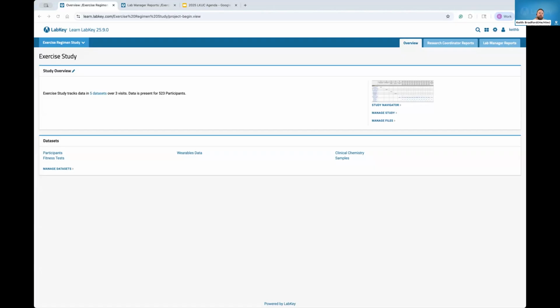Yeah, so one of the things that we hear a lot from clients is that they appreciate how LabKey allows them to centralize and synchronize their data. But more and more, we're getting feedback about the reporting that the groups then need to do. And not just reporting to their researchers or their science teams, but also needing to report to a variety of different audiences, maybe project managers, operations teams, maybe different lab teams, executives, managers, and external collaborators are all kind of customers that need to receive reports and receive downstream data.